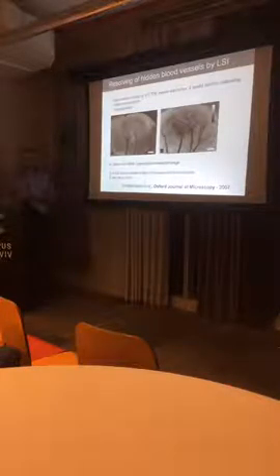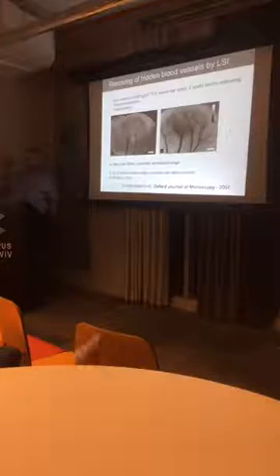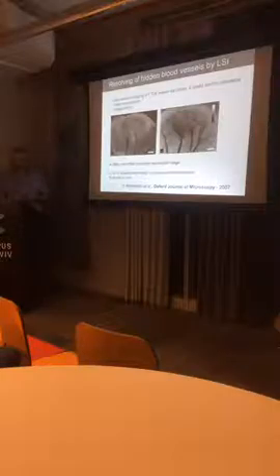Why do we need the speckles and not the light in the center of the light itself? This is standard light. We don't see anything. No, I mean, is that because the variance is larger? The variance is larger where there is no flow. No, I'm asking, you're talking about the speckles and there is the center of the light.